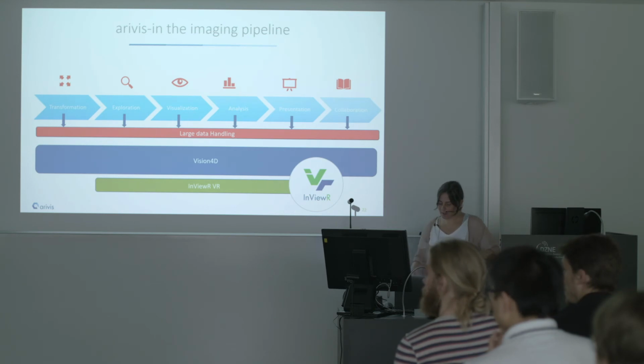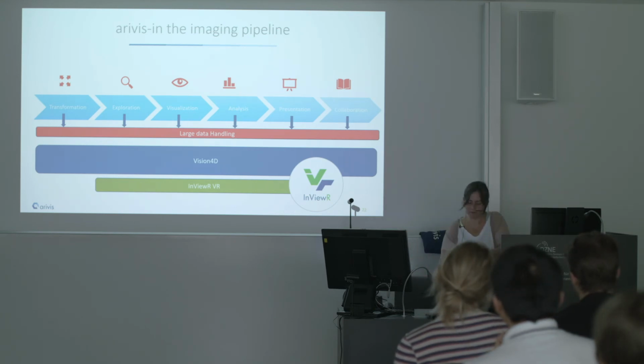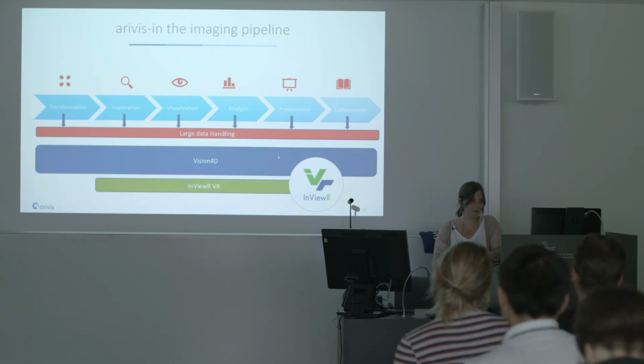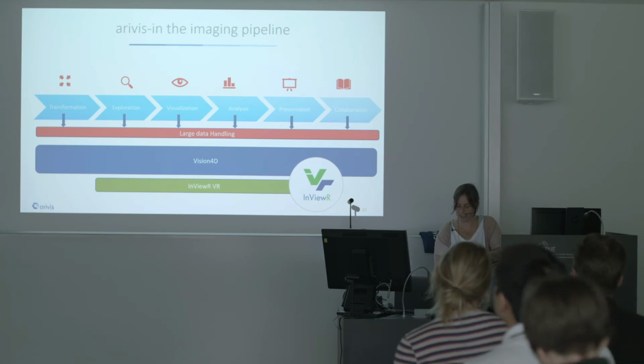So I've shown you some example workflow steps if you were using ARIVIS Vision 4D, and it is really a routine tool. You can apply it to your routine work with the digital image data.